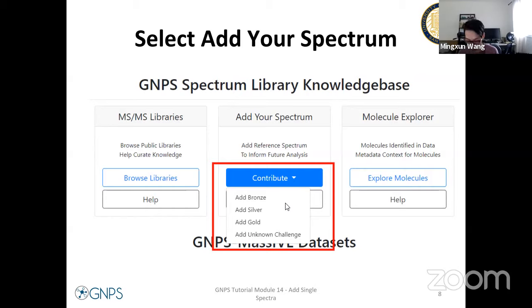And so one of the questions that you might ask is, how can I trust anything? And so number one is everything is putative to begin with, but we have the provenance of where the data came from, including the person who uploaded it and the lab. So at least if you suspect it's correct or incorrect, you can follow up with the original contributor, and hopefully it saves you time that way.